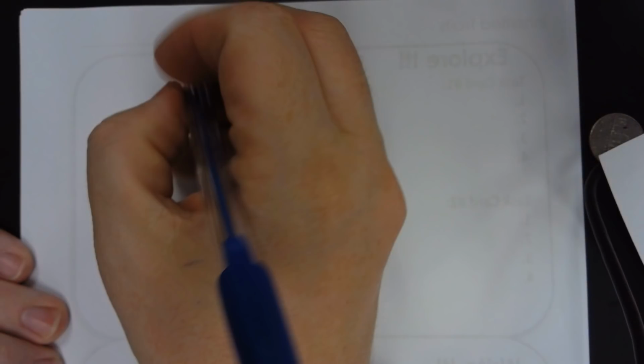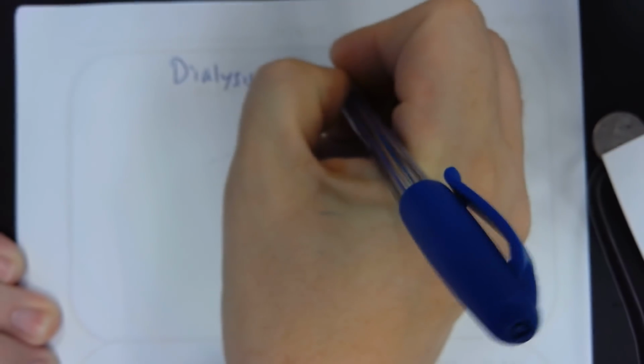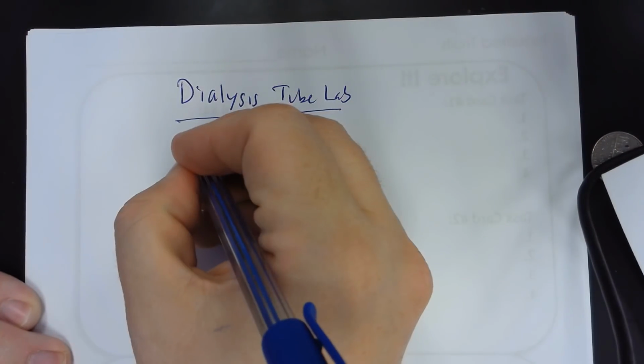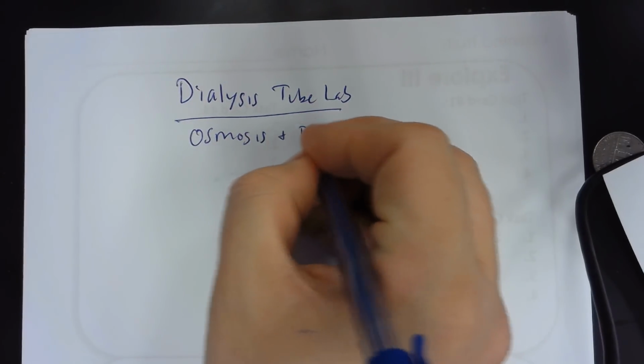Okay, so we want to take a look today at explaining the dialysis tube lab. In the dialysis tube lab, we are really looking at two major phenomena, two major concepts, and that is osmosis and diffusion.